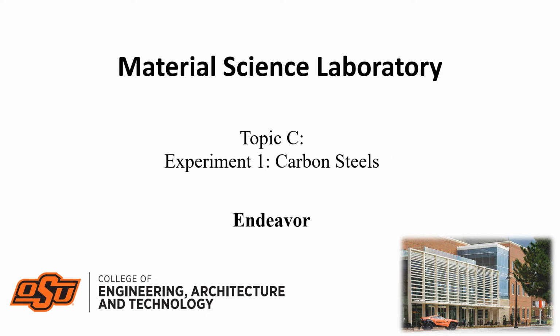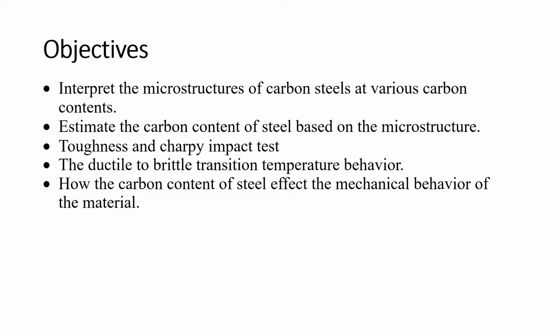Hello everyone. In this mini lecture, I'm going to talk about the carbon steel experiment. Here are the major objectives. You'll learn how to interpret the microstructure of carbon steel at various carbon contents. You'll also learn a technique to estimate the carbon content of steel based on the microstructure.